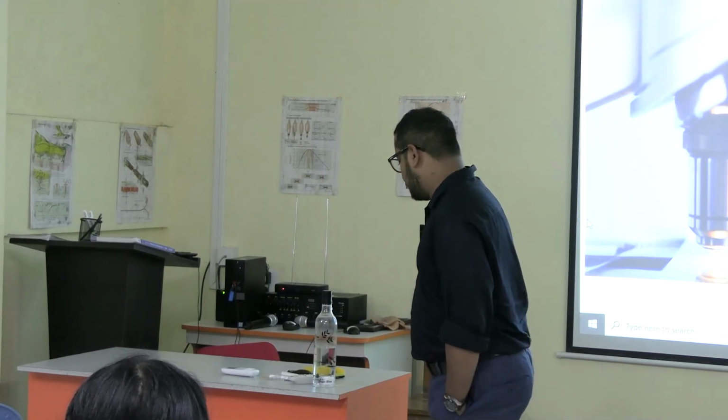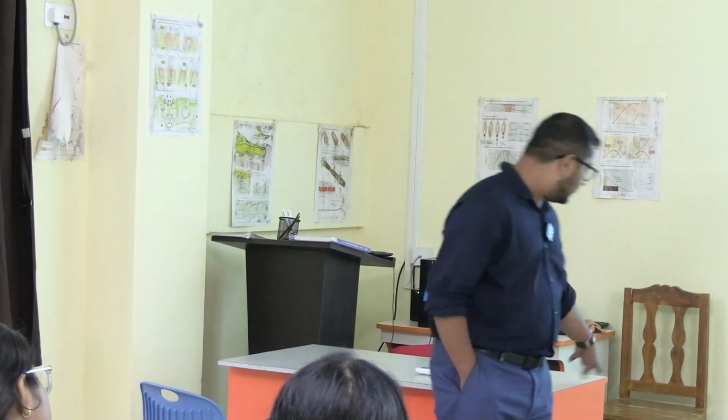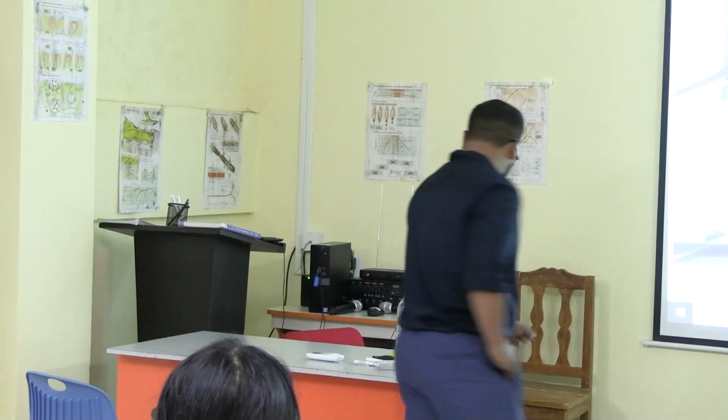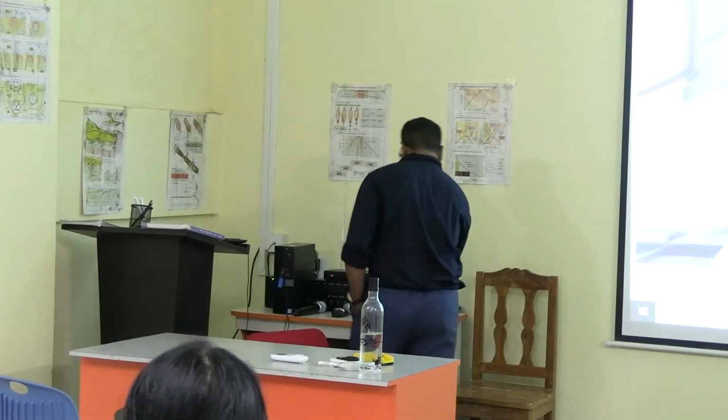Okay. So a microscope is basically an instrument, or you can say a device. So sit down. So basically we see the objects which are not visible through naked eyes. Okay. Now we are going to study the compound microscope.